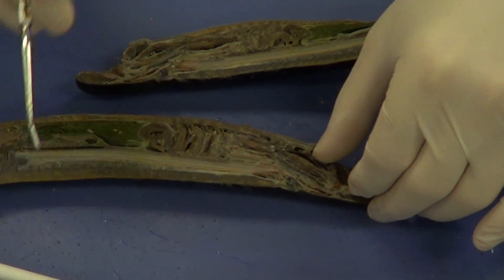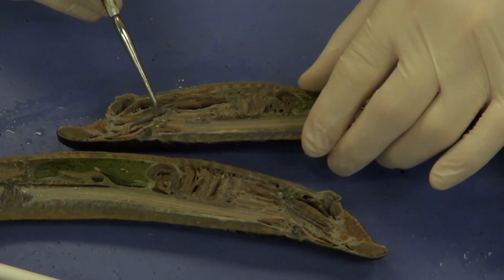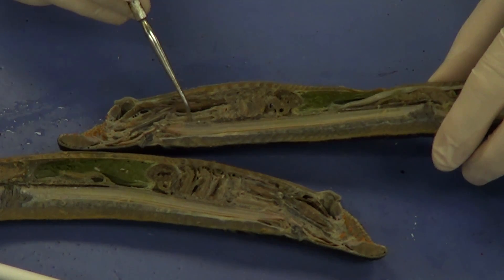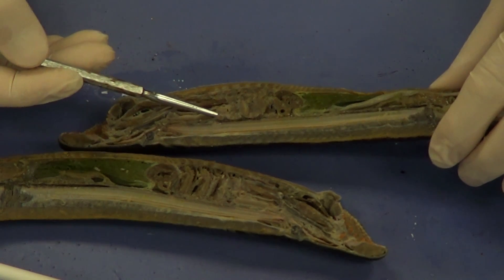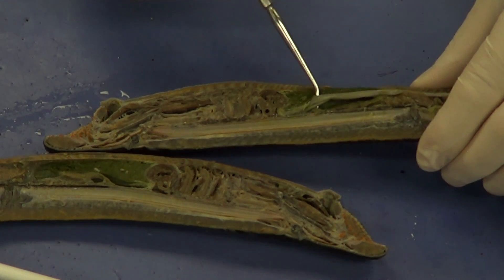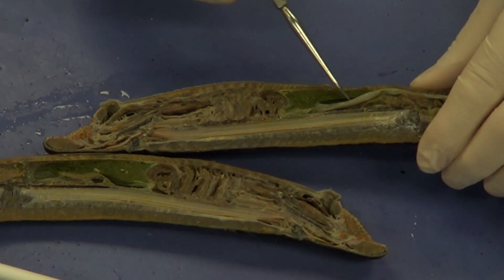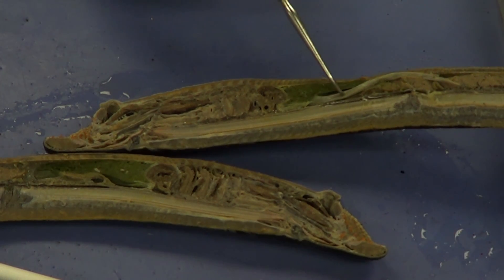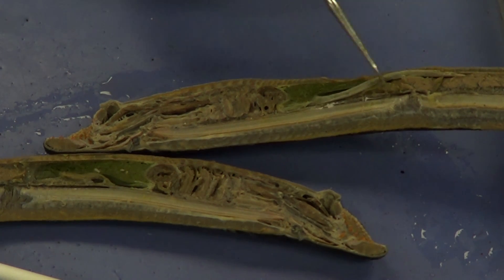If we take a look at this side, we can see the pharynx even more clearly. Here is the dorsal branch, which is going to give rise to the esophagus — I'm putting my probe right into that esophagus. Eventually the esophagus is going to give rise to the intestine, which you can see right there, just dorsal to this big green organ right here called the liver. And you can see how the intestine sort of dives ventrally.